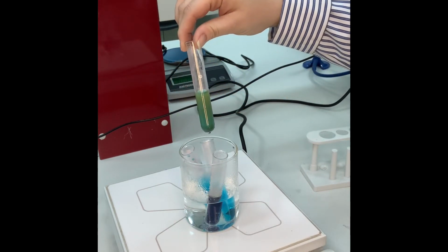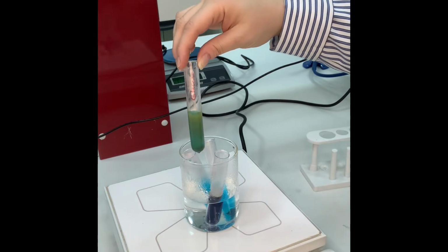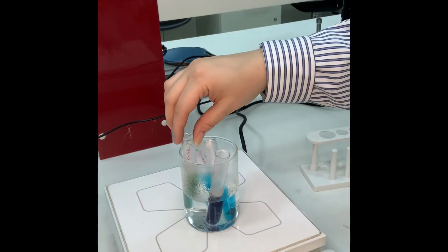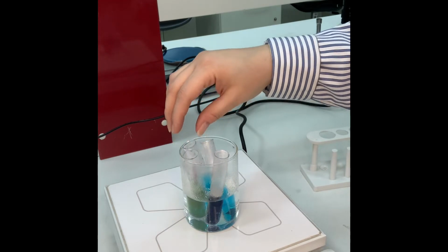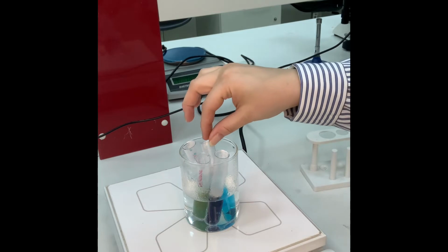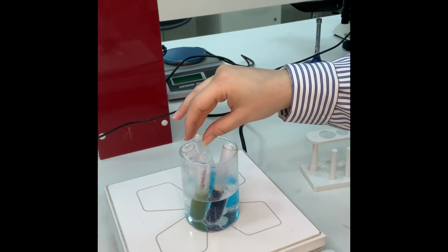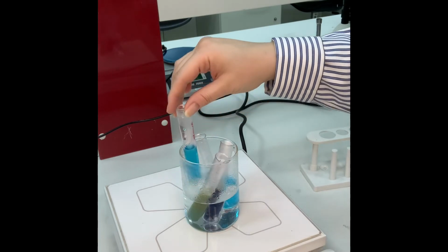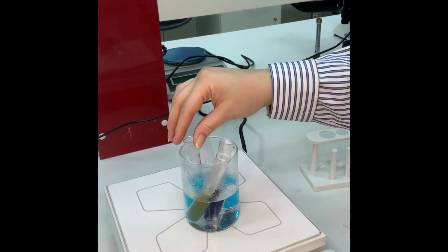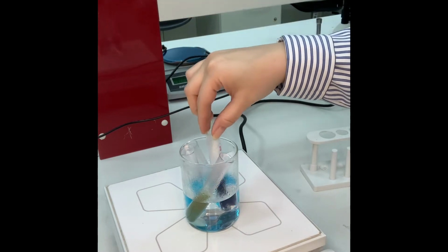It becomes yellowish into a greenish, let's say, and I will keep it till we have the color that we're aiming for. It's very important. This is the reason I should always use a negative and positive control. Look at the starch solution, and this is egg white. Nothing happened so far.